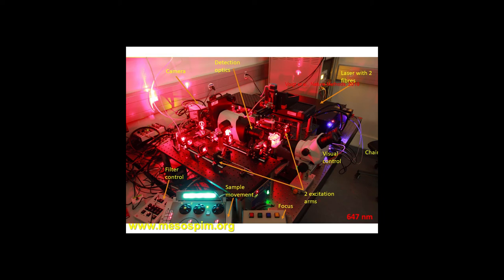And essentially, this is the machine, I know it doesn't look like a microscope, but the guys, they put all the labels, so you understand what it is. Here is a camera, here is the detection optics, here is actually the cuvette with the sample, and the light comes in from the side, and then, here, so this will be the excitation pathways, this is a chair, just in case you don't understand.